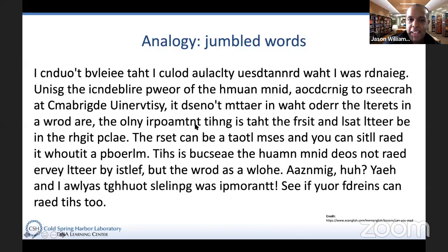Here is another analogy, and it's an interesting one. I'm going to give you one more. Sorry, I'm giving you all these analogies, but I think maybe you have to think about this in certain ways or multiple times, and one of them might click. Can you read this?